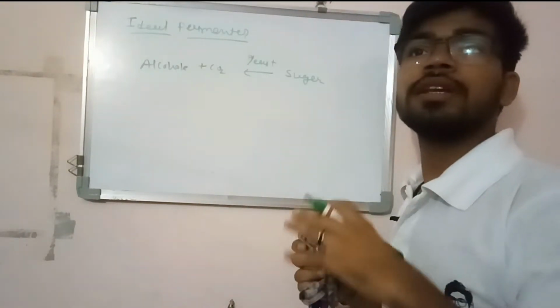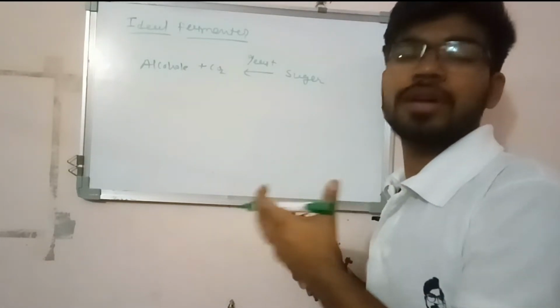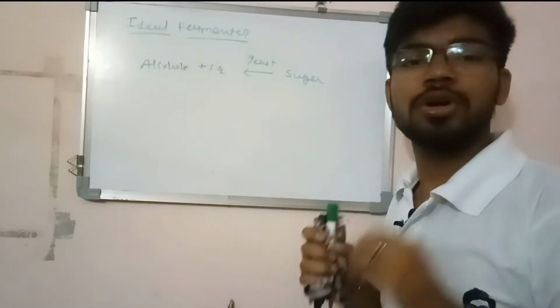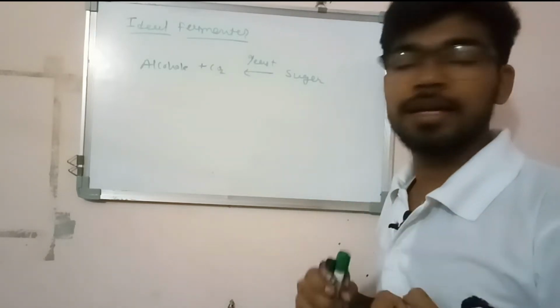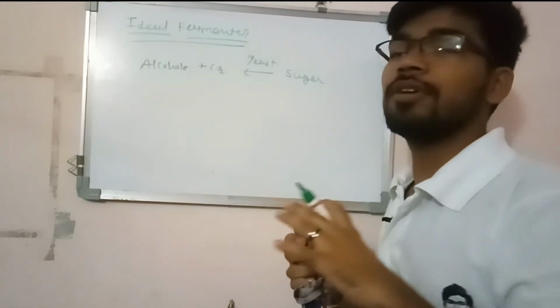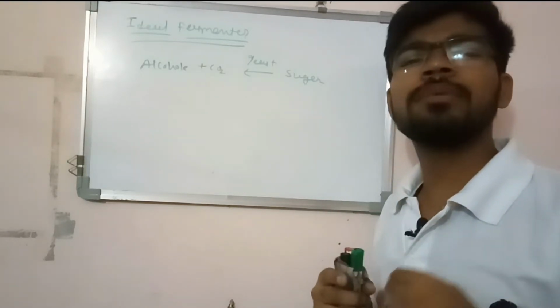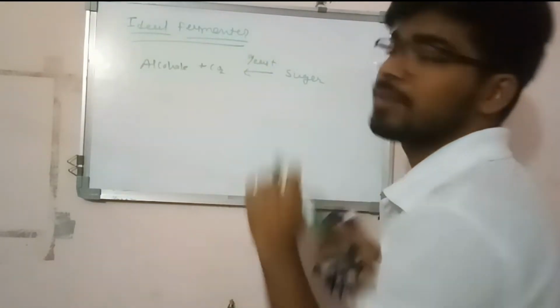In industry we need to produce lots of things, lots of byproducts of various organisms. For this we have to give ideal conditions to the organism to grow and make an excess amount of the metabolites which we require. So for this we require an ideal fermenter. If we want to define an ideal fermenter, then it is an apparatus or instrument which maintains optimum conditions for the industrially important organism.